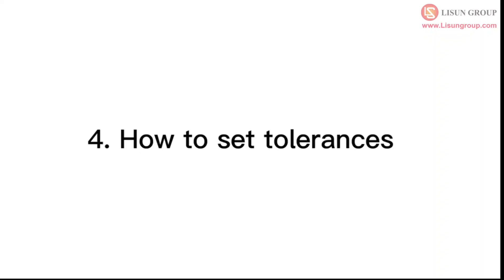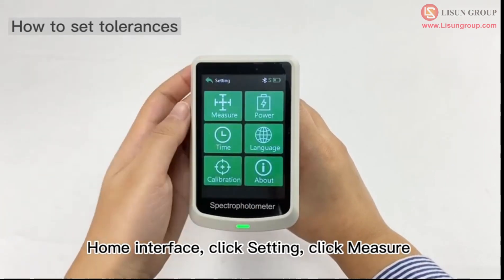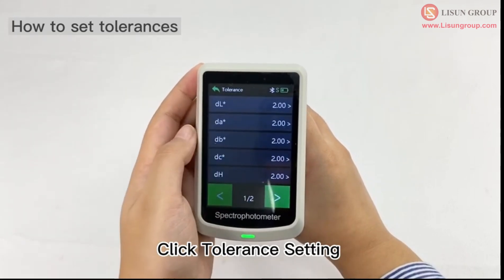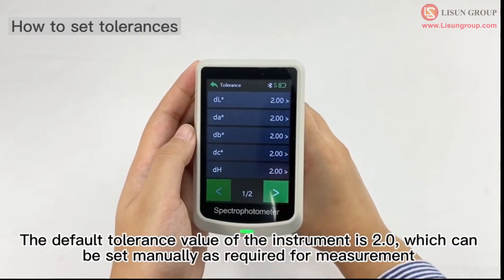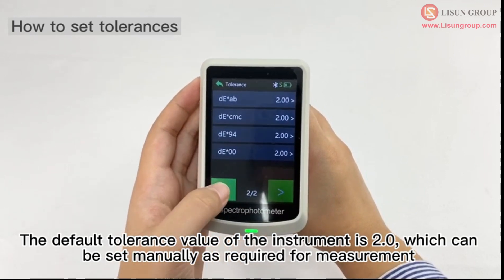How to set tolerances. From the home interface, click setting, then click measure, then click tolerance setting. The default tolerance value of the instrument is 2.0, which can be set manually as required for measurement.